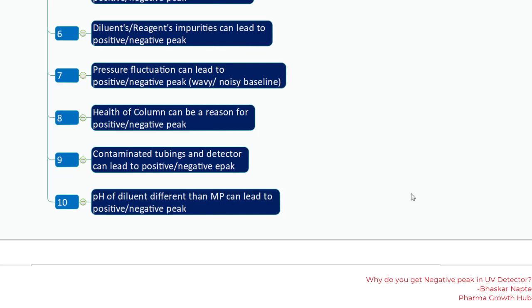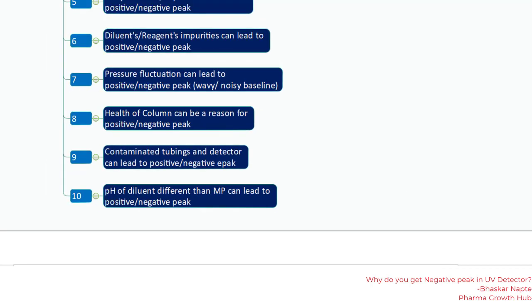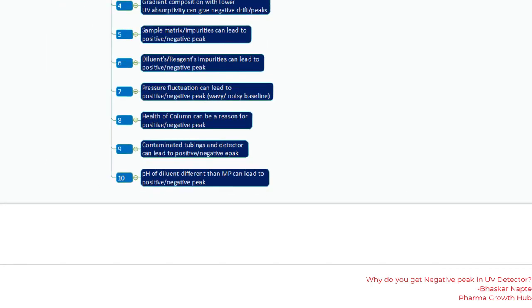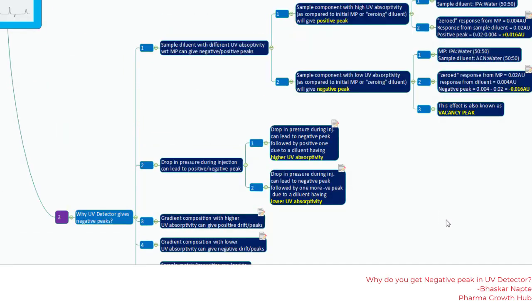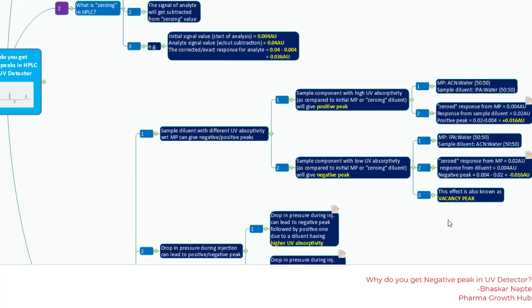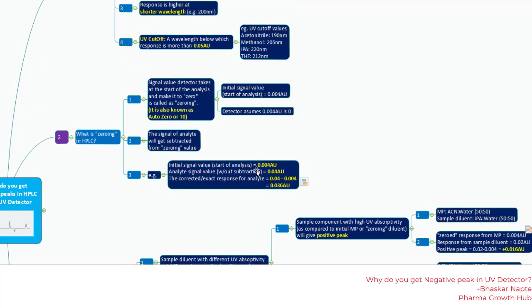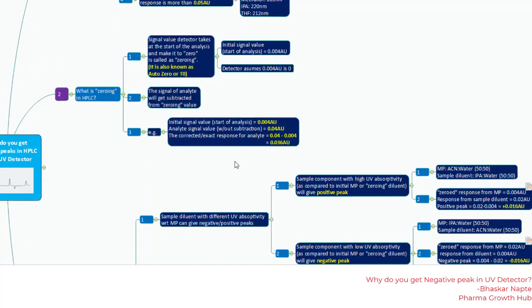These are the important points I wanted to share today. I hope this entire presentation helps you understand how negative peaks can be observed using the UV detector during your chromatographic run. Thank you very much for watching this video — I will meet you soon with more useful and informative videos. Till then, take care and bye-bye.